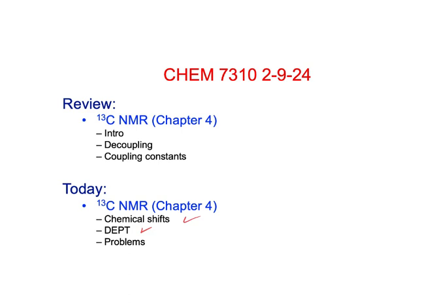It is a C13 NMR experiment where we can get information about the number of protons that are attached to each carbon, rather than having to do a coupled C13 spectrum. That one's pretty common, and then we'll work a few more problems after that. So next week, we'll probably start into IR, but that'll only take us a day or two, and then mass spec after that. Okay?